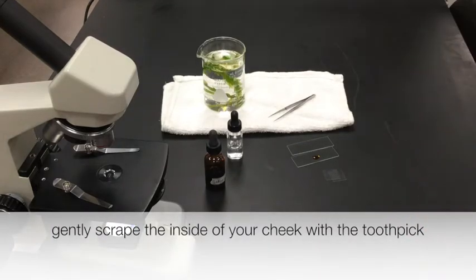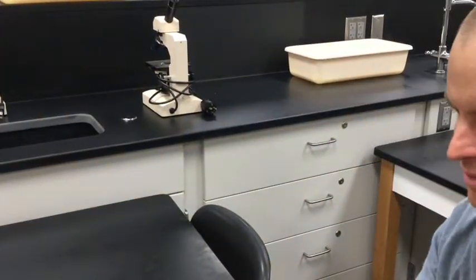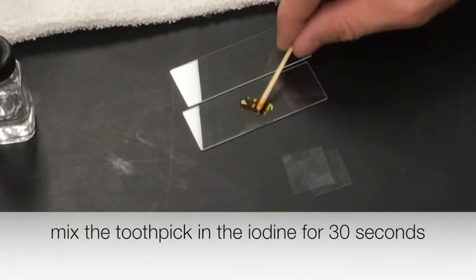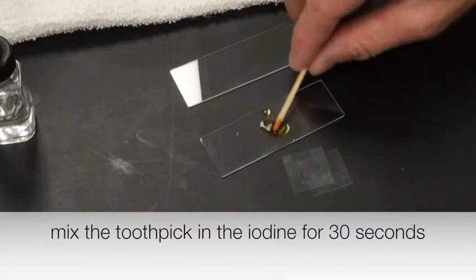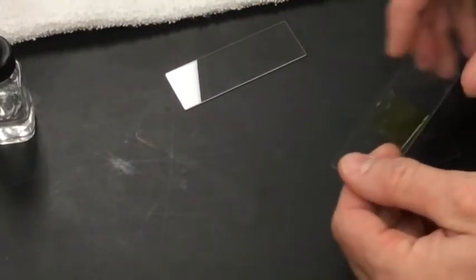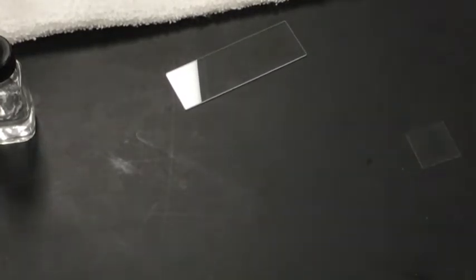Take the toothpick — kind of gross, but I scraped the inside of my cheek with the toothpick gently. Now that I've hopefully gotten some cheek cells, I'm going to move it around in the iodine solution a little bit. After about 30 seconds I'll take off the toothpick, cover this with a cover slip, and now I can look and hopefully find some cheek cells under the microscope. That's for the animal cells.